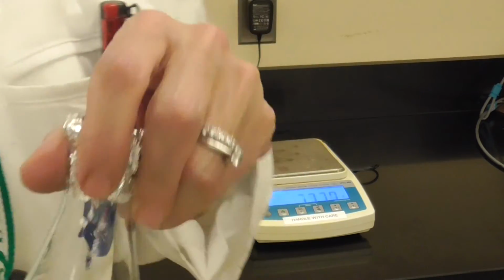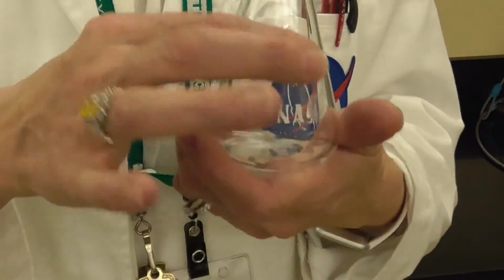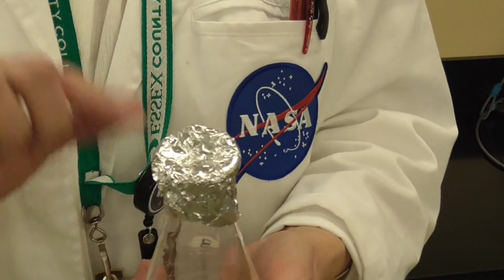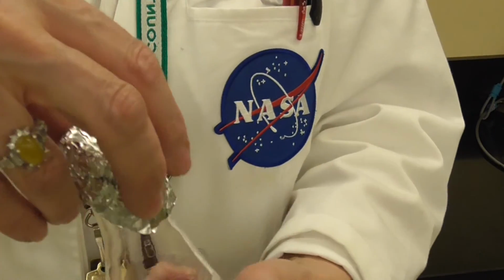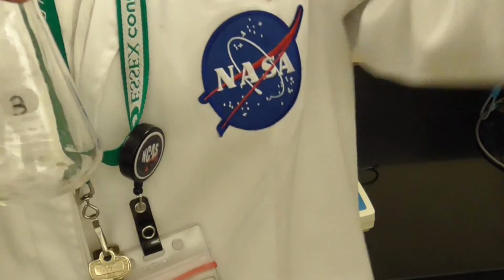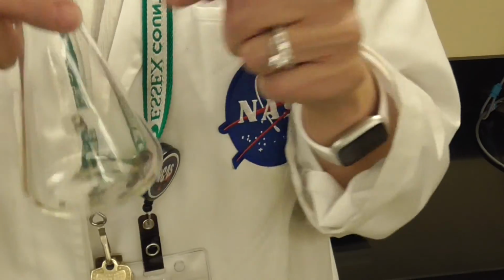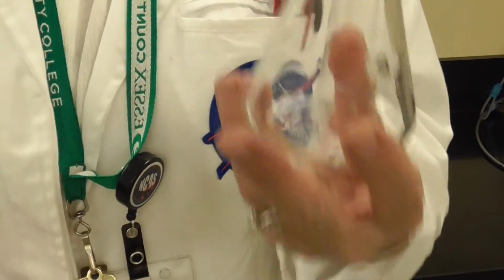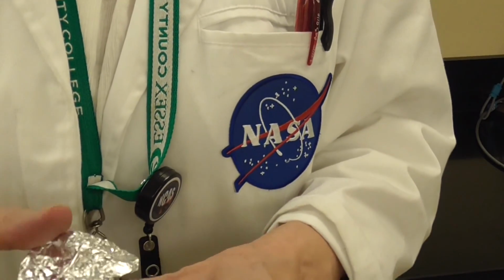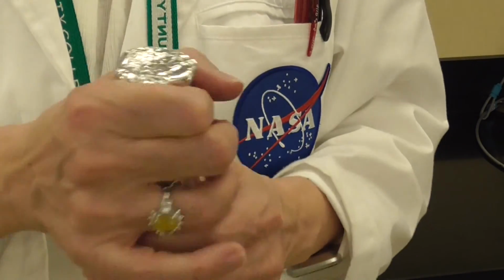How about the volume? The volume of the unknown, we usually take as the volume of the container because it was gas. So in order to calculate the volume of this flask, we are going to rinse it, fill it with water to the rim, and then transfer the water into a cylinder, and we measure how many milliliters is the volume of this flask. Once we have the mass of the unknown and the volume of the unknown, we will be able to measure the density of this unknown.